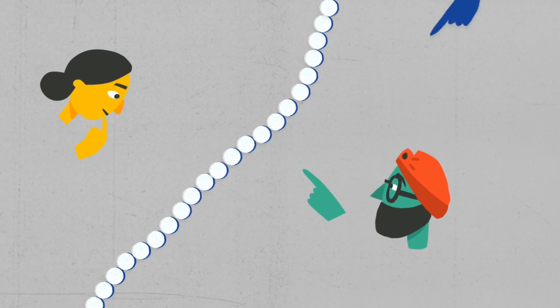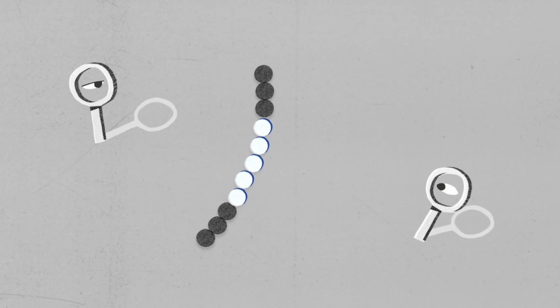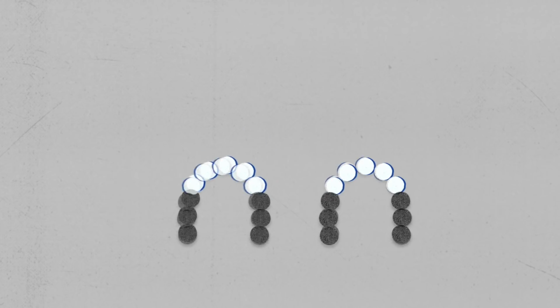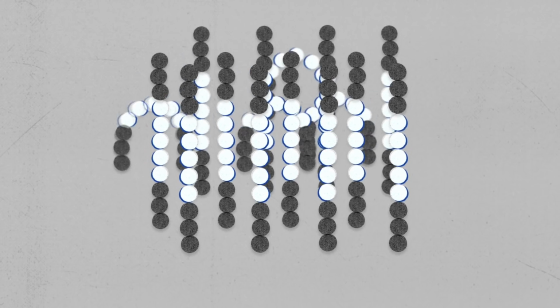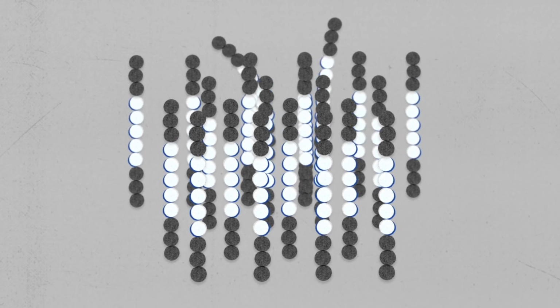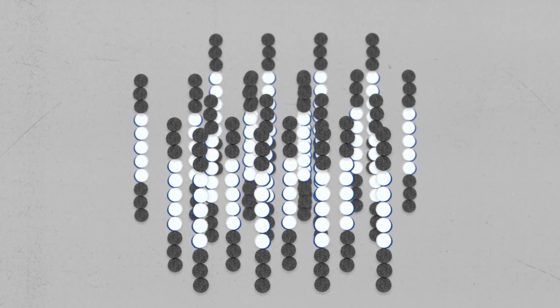To prepare the DNA for sequencing, they begin by chopping it into fragments. These fragments, known as the DNA library, are attached to a surface at both ends using synthetic DNA. The tiny bridge-like structures are replicated using an enzyme to create clusters which together have a stronger fluorescent signal, making them easier to photograph. They're cut from the surface at one end, ensuring that each cluster of DNA fragments stands vertically like a clump of grass, ready to be read from tips to roots.